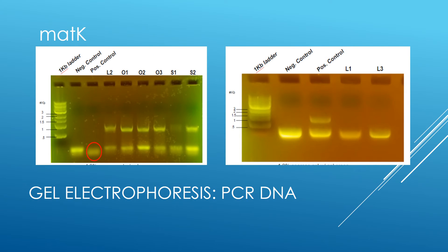If annealing of the MATK primer set was successful, a bright band would appear around 0.8 kilobases in addition to the primer dimer. As you can see in these gels, L2, S1, S2, S3, O1, O2, and O3 were successful, but samples L1 and L3 were not. For this run, an error occurred with the positive control because the only band to appear was the primer dimer. Again, this could have been an experimental error.